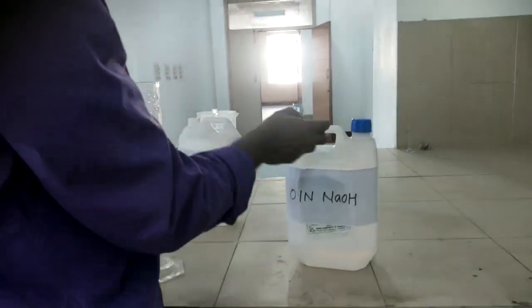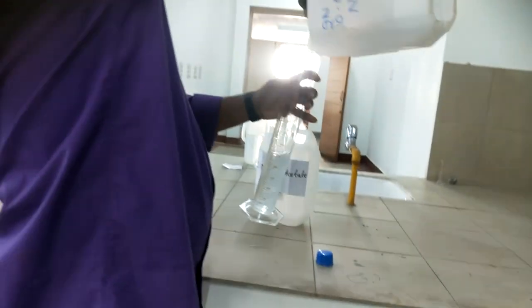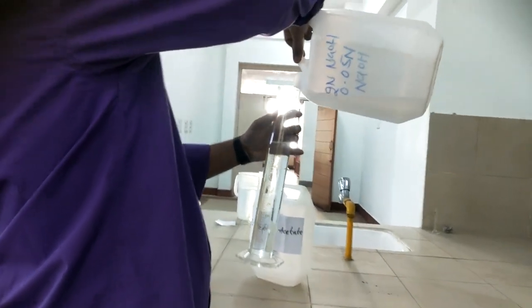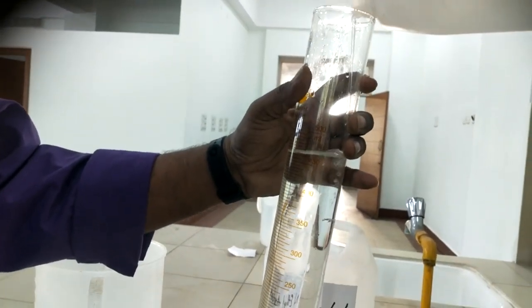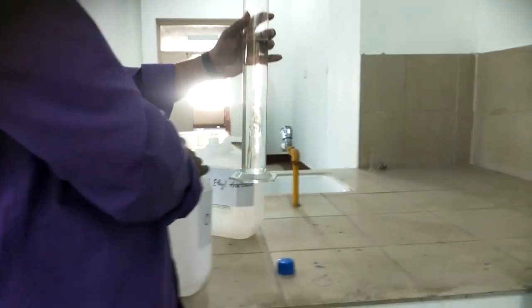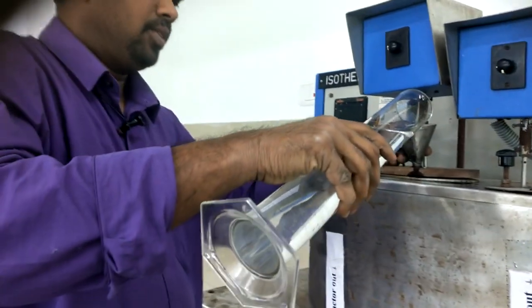We'll add 500 ml of 0.1 normal NaOH. So we are adding 500 ml of another reactant, NaOH.